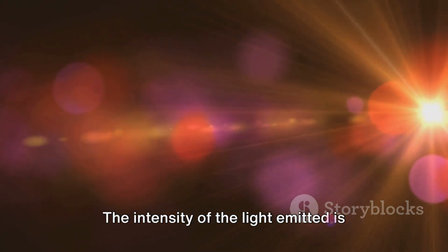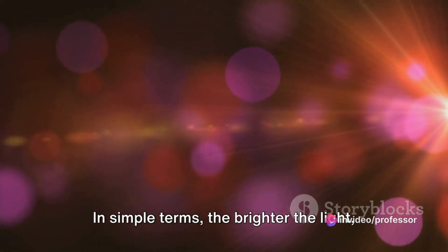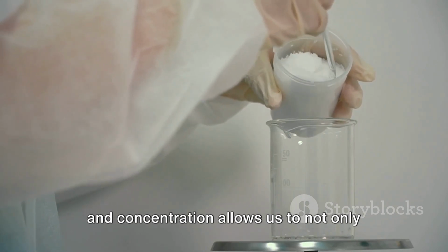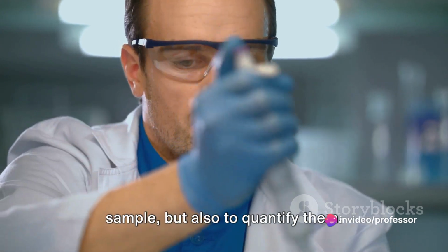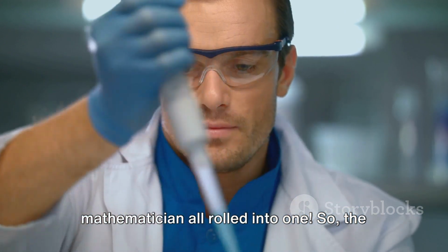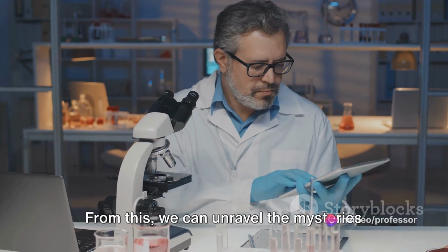Now, here's where it gets even more interesting. The intensity of the light emitted is directly proportional to the concentration of the element in the sample. In simple terms, the brighter the light, the more of that element is present in the sample. This relationship between light intensity and concentration allows us to not only identify what elements are present in a sample, but also to quantify them. It's like having a detective and a mathematician all rolled into one. So, the light emitted tells us the story of the element's concentration in the sample.